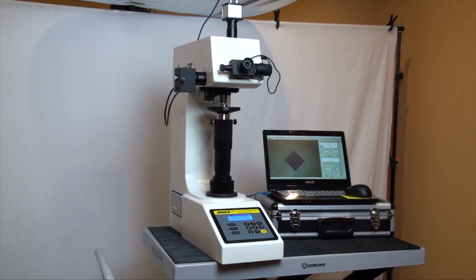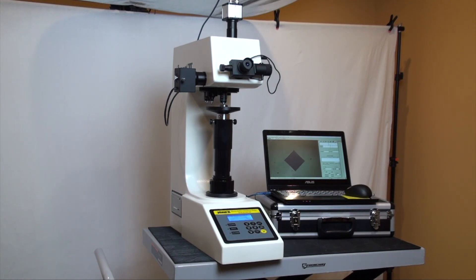Phase 2 Macro Vickers hardness testers are closed-loop load cell-driven systems that provide the user with high precision performance and results.